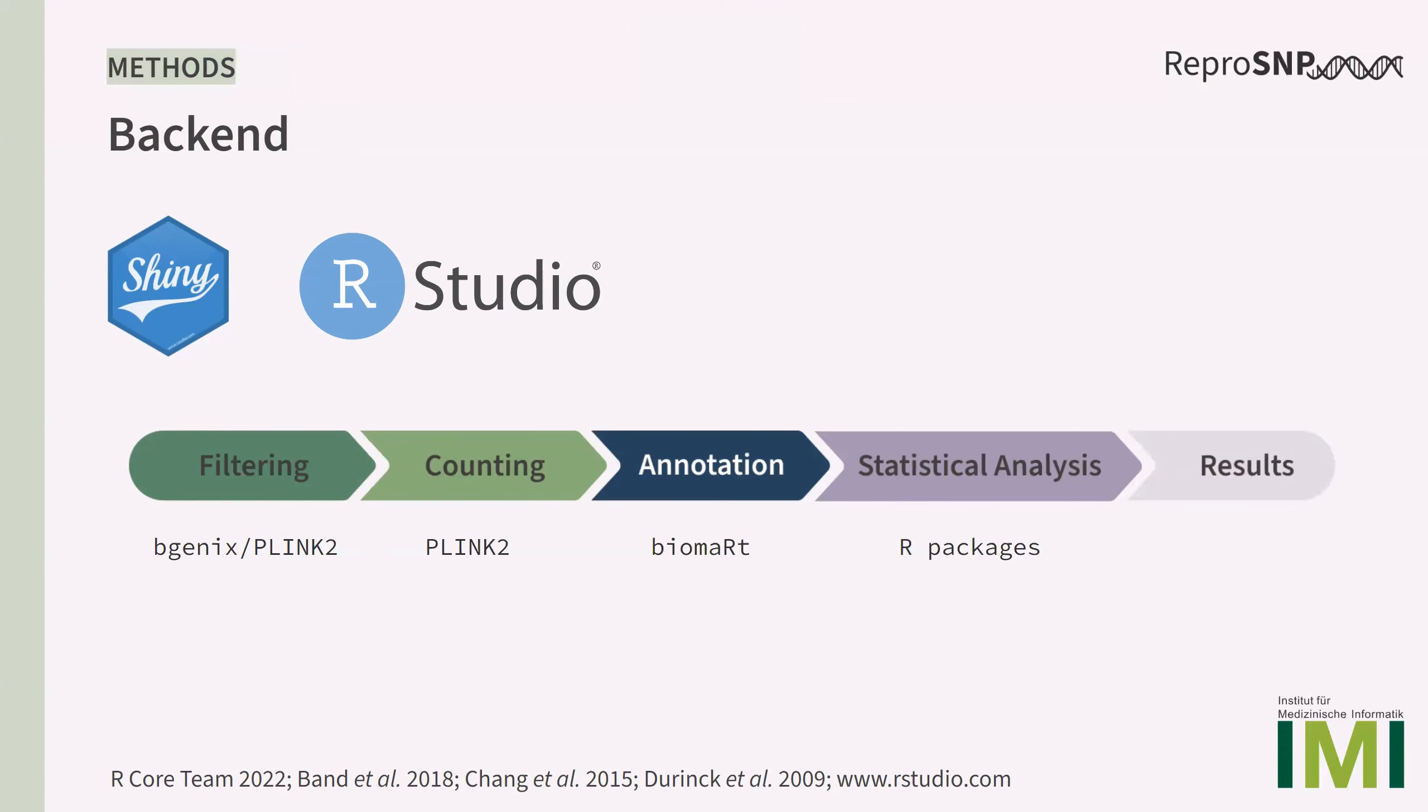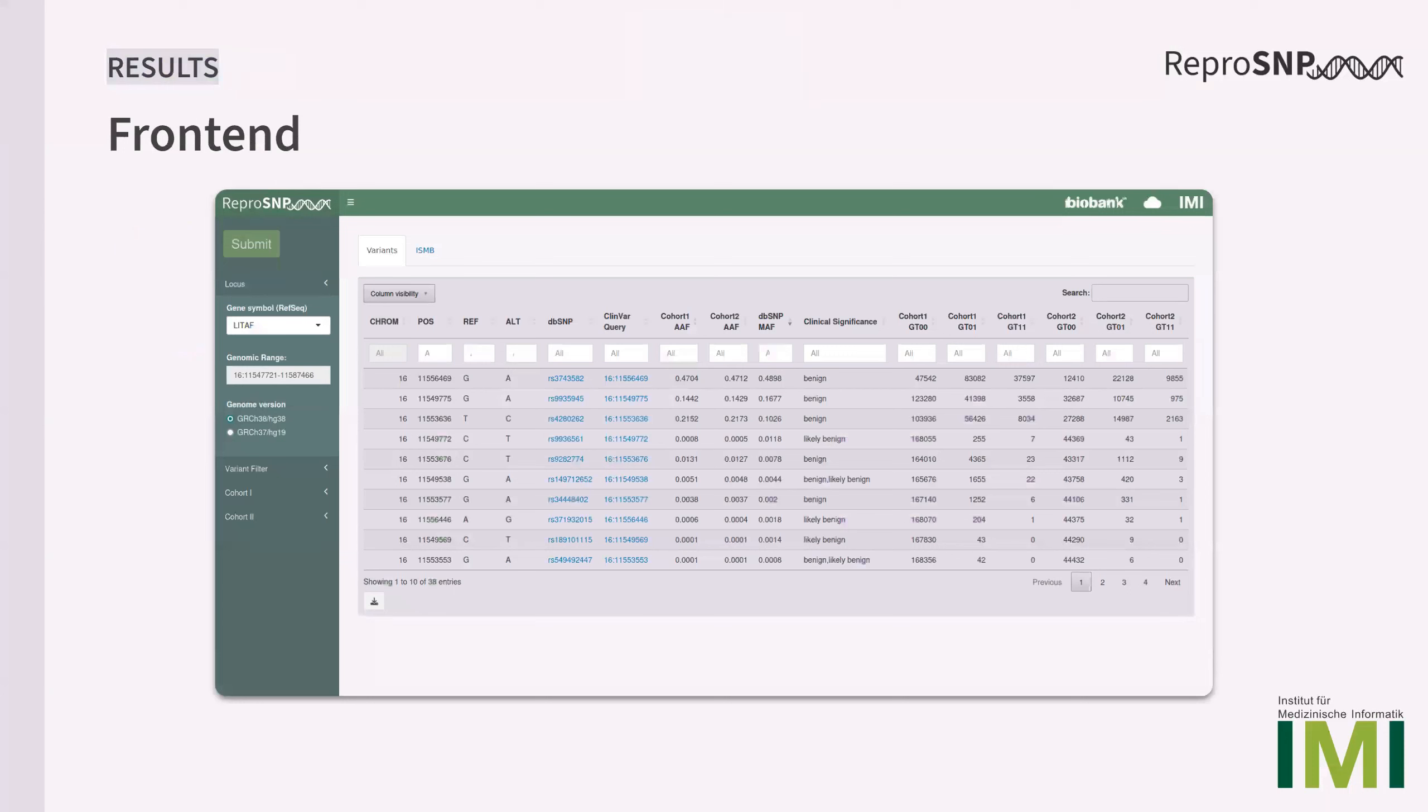The results are then displayed as table in the user interface. Here you can see the main output of ReproSNP. On the side, the user can select a genomic range of interest and if necessary click a lift over option. Below, two cohorts can be defined by the user, which are by default the cohorts that I just showed you.